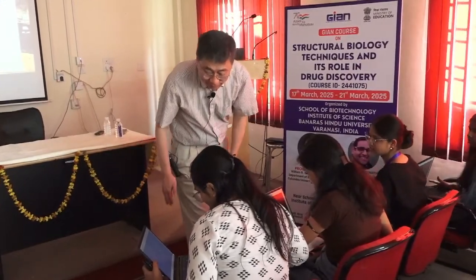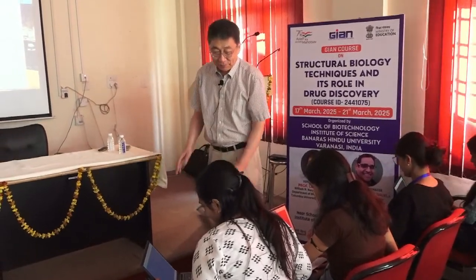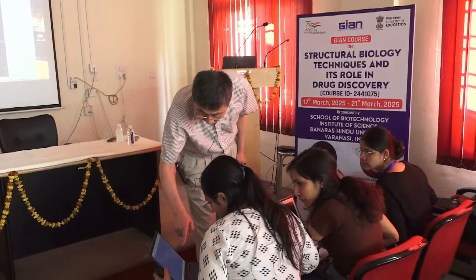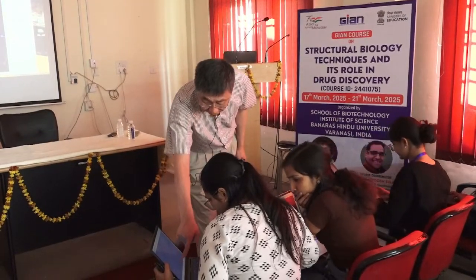So now, can you zoom in? Zoom up a little bit? Oh, you're good at trackpad. That's great. Okay. Zoom in a little bit. You can see the vanillin, right? Zoom in more. Yeah, there you go. See, and that's the actual density right there.